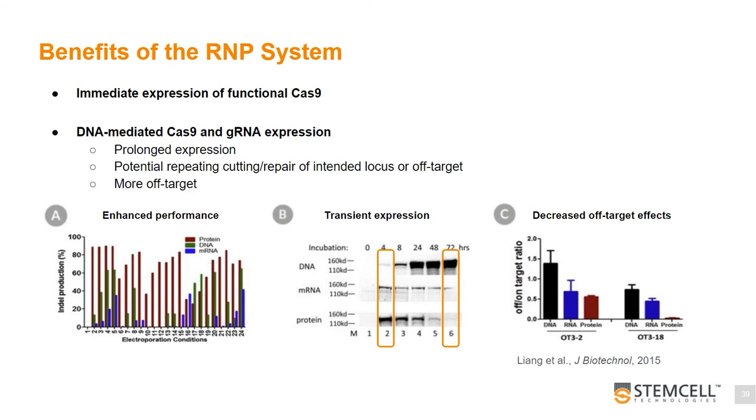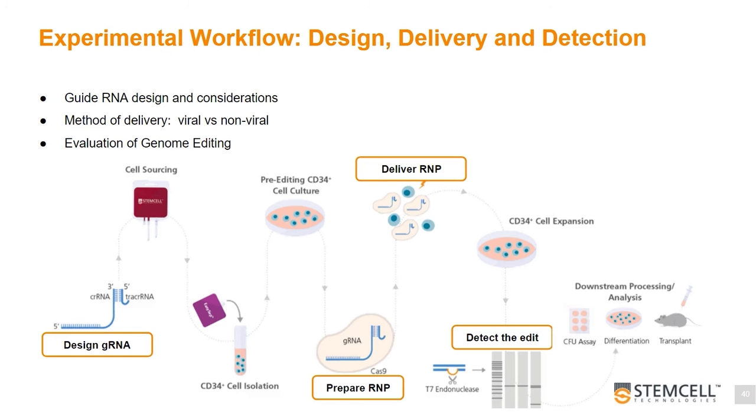In Figure C, taken together with off-target analysis at two predicted off-target sites for this guide RNA, there is a clear relationship between prolonged expression and increased off-target effect, with DNA-based expression showing the highest level of off-target effect compared to mRNA and protein systems.